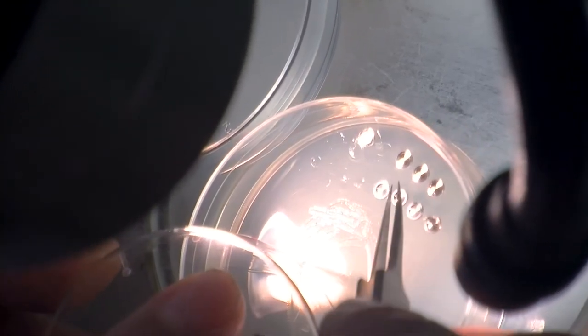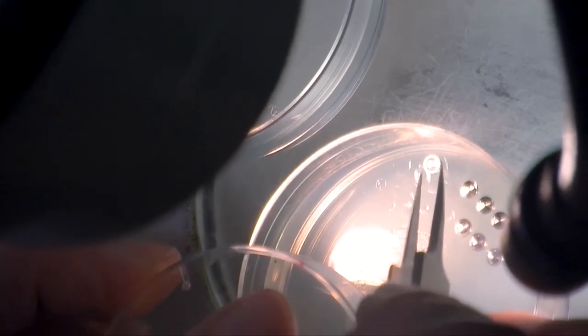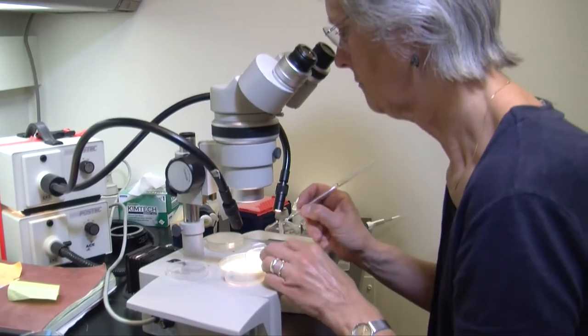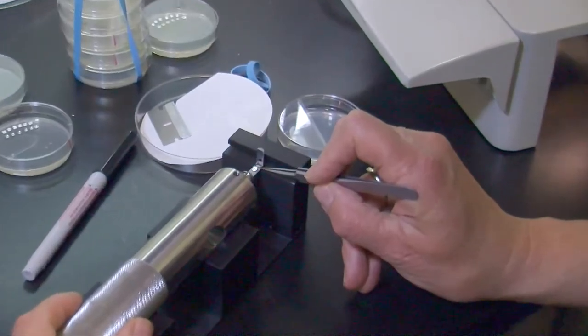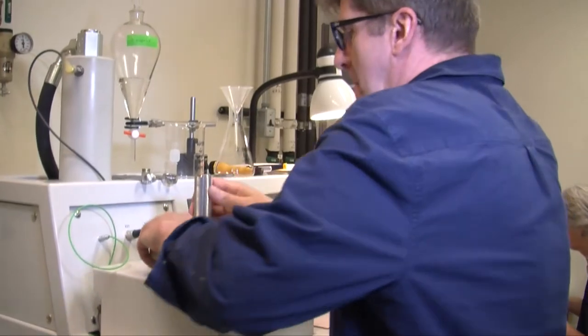It's not because we're trying to trick the nematodes into having a little meal and not paying attention to what's happening. We're putting this layer of E. coli in there so we have this solid biomass. The nematodes dive into the biomass. Now what we have is this solid structure that doesn't have spaces in it, and we've sandwiched it between these aluminum plates. And then we've frozen it super fast with high-pressure freezing, so there aren't little gaps in there to cause problems.